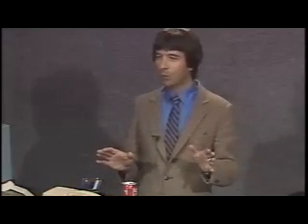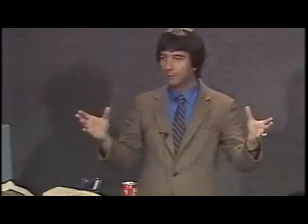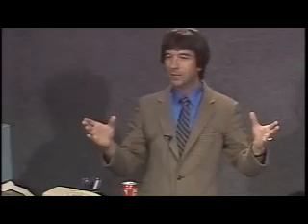To give you an idea physically of how that works, imagine that you have a surface with metal atoms sitting on the surface. We apply a high positive bias to the surface. We create a high electric field.